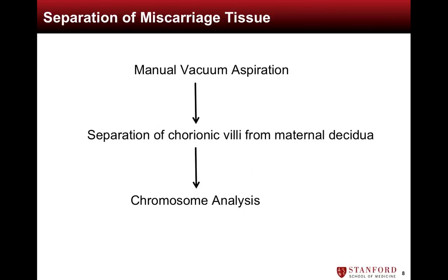We will now review the procedure for separating miscarriage tissue from maternal decidua for chromosome analysis. A MVA is first performed, followed by separation of chorionic villi from maternal decidua using a technique which we will demonstrate. The villi are then sent for chromosome analysis.